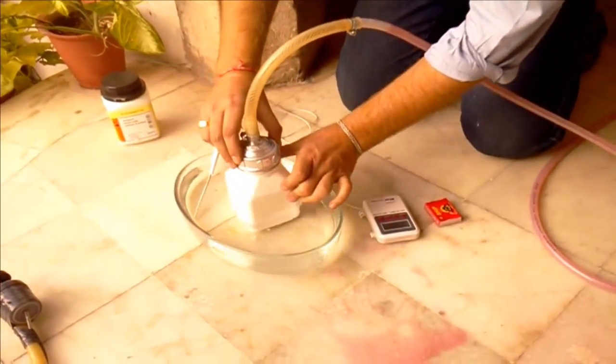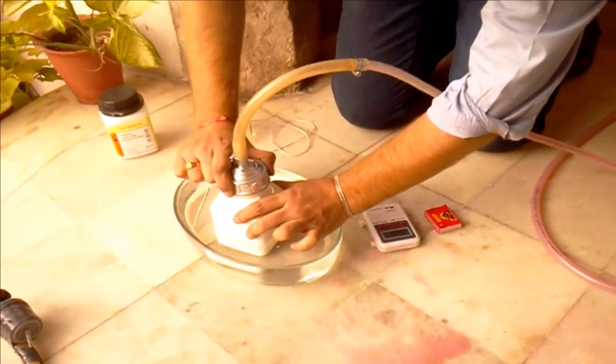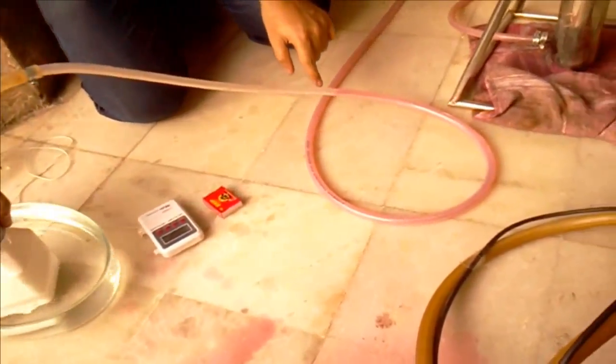The production of hydrogen has started. At the same time you can see the flow.